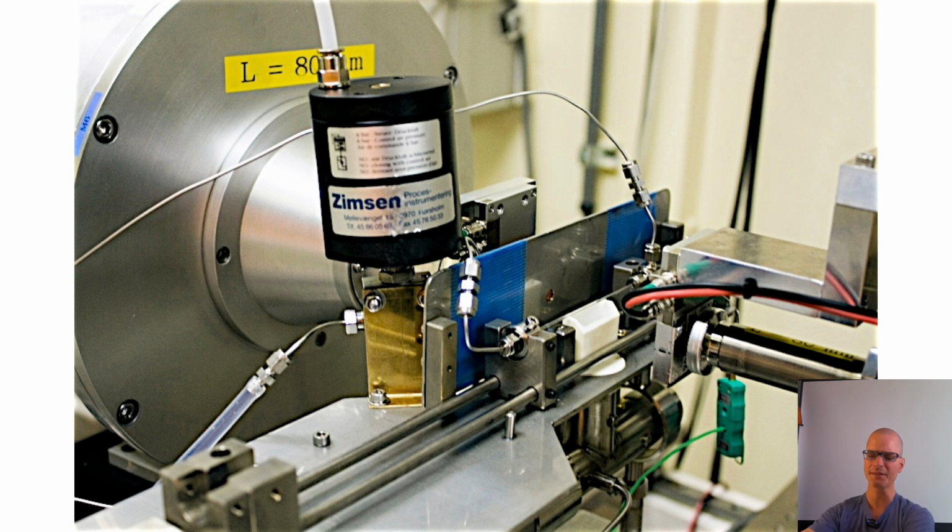So I started experimenting with alternative methods for analysis. And so McSAS was developed. I was quite surprised that it worked myself, but it's a very pragmatic, sort of brute force way of getting some structural insight into what's going on in your sample.